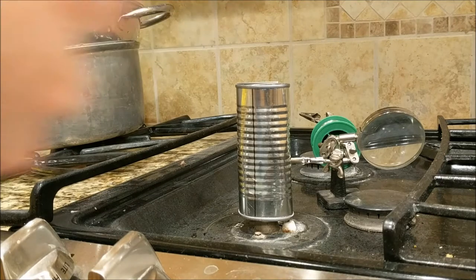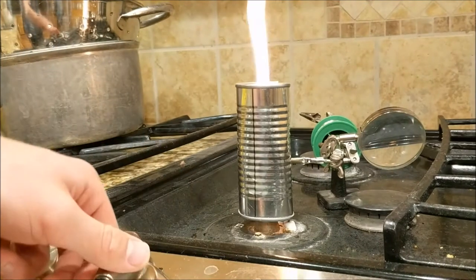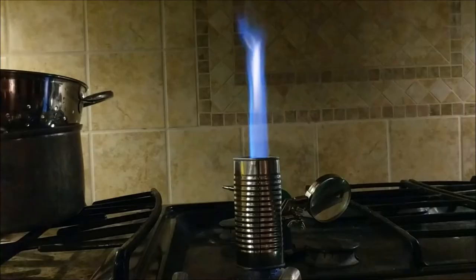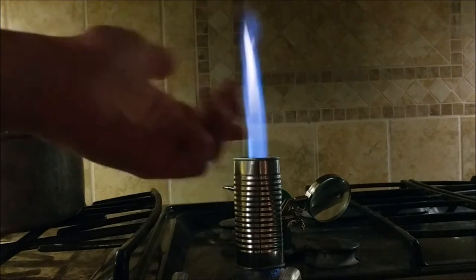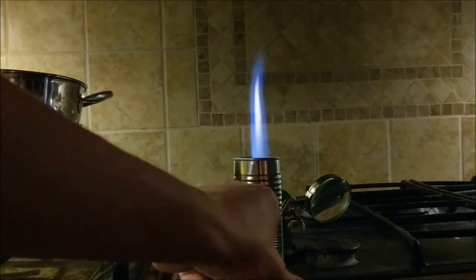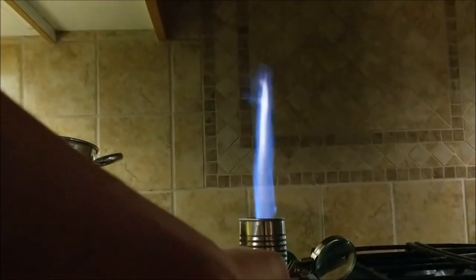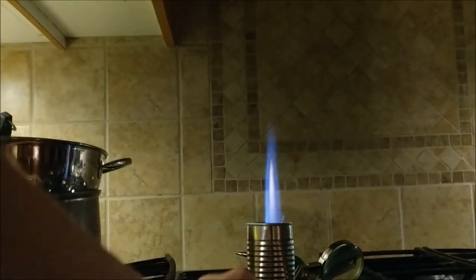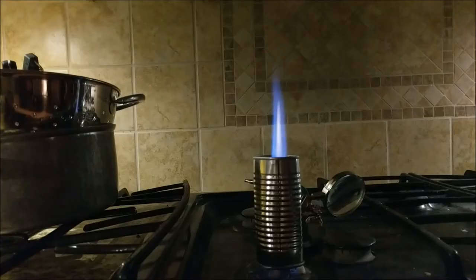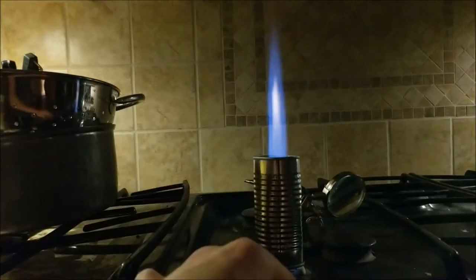Now that your entire Bunsen burner setup is set, you can turn on the stove — make sure to turn it to low. Light your fire a little bit underneath, turn it up a little, and you should see a little flame growing on top. This flame can be better seen when it is slightly dark inside the room. As you can see, I can easily adjust the height of the fire by adjusting the gas amount flowing into the stove. I can easily make the fire extremely tall. This little Bunsen burner setup works extremely well, especially for just using your stove as the actual Bunsen burner.